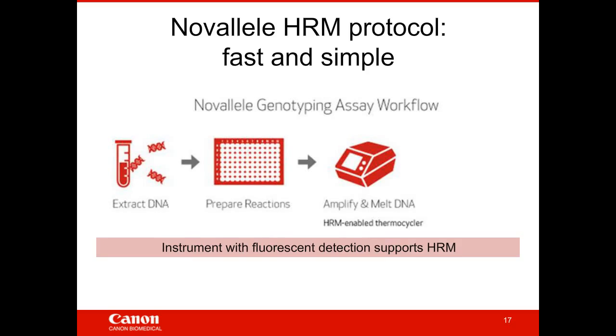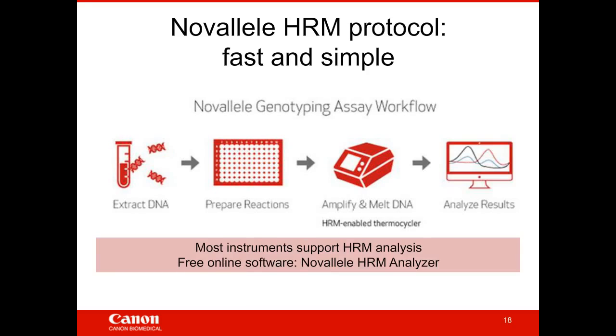Next is to run those reactions on an instrument with fluorescent detection that supports HRM. Most real-time PCR instruments have HRM capability. I will be providing examples of those towards the end of this presentation. Finally, the last step is to analyze the data.